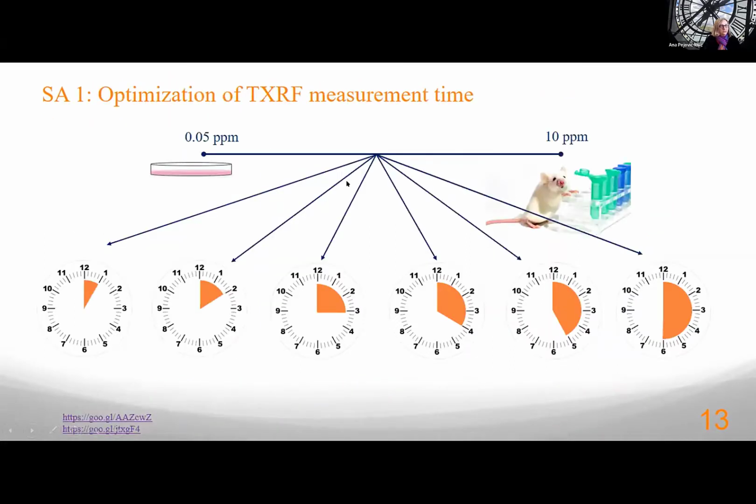We also had to look at and optimize, or rather minimize, the measurement time because of the throughput that the clinical world needs.